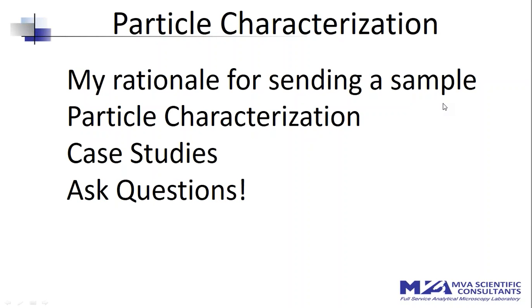And then finally, if I don't hear from the lab, if they tell me it's going to take 10 days or 2 weeks, and I don't hear from them, I'm going to give them a call and say, hey, what's going on with my sample? Where are we? Is there anything I can do to help move it along? So that type of communication for me is very important when I send a sample out, and I would assume it is to most of the people listening today.